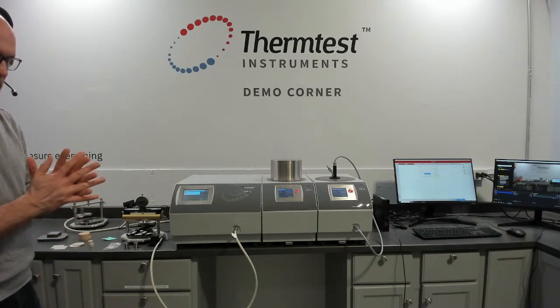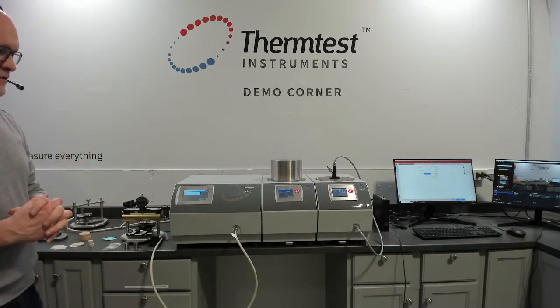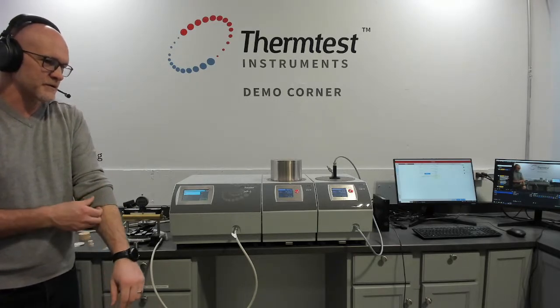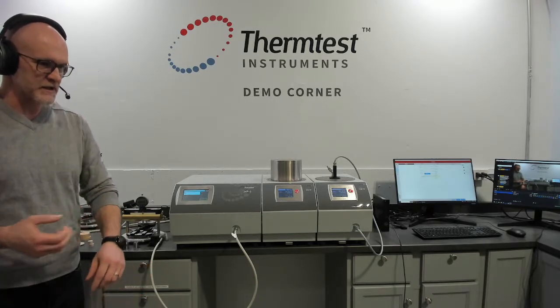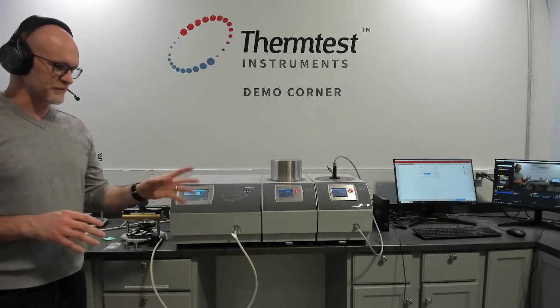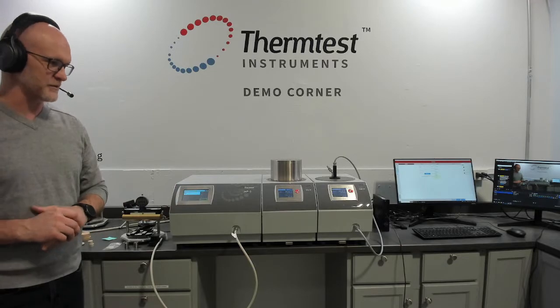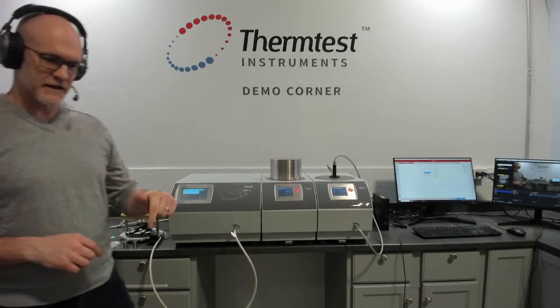But before we do, by tradition here at the demonstration corner, we do a little circle to show the equipment that we have available for demonstration and training, whether it's before sale or after sale, and this is really a critical part of what we do here at Thermtest. So let's turn the camera.